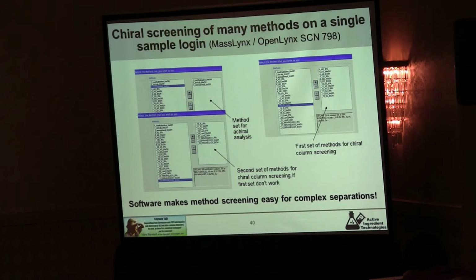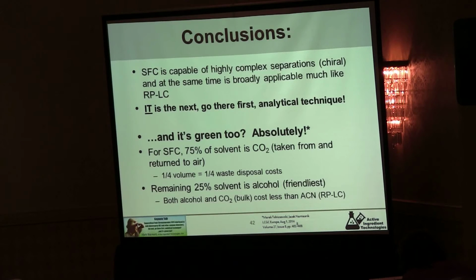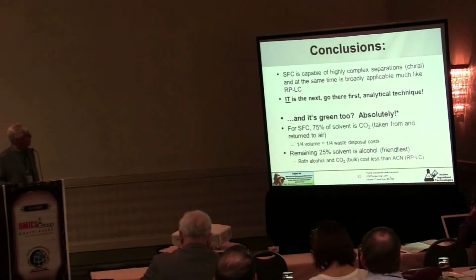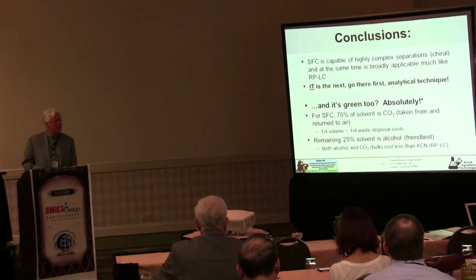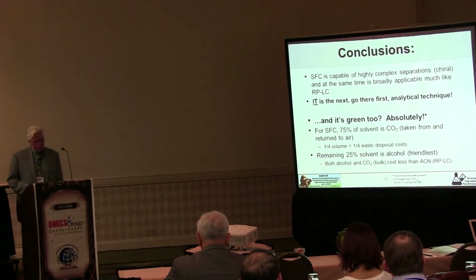So software enables that. So things are easy. Here's a chiral example, 12 different runs, 4 columns, 3 solvents. Can quickly find a chiral separation there. And then just to conclude, I'd like to say SFC is highly capable of doing excellent separations, highly complex chiral separations, but at the same time it's very broadly applicable, like reverse phase HPLC. It is the next go-there-first analytical technique.